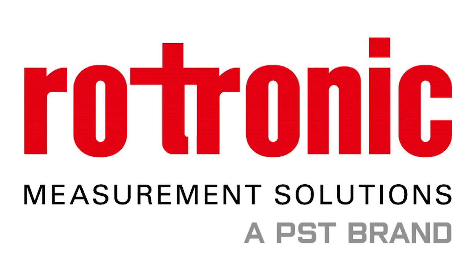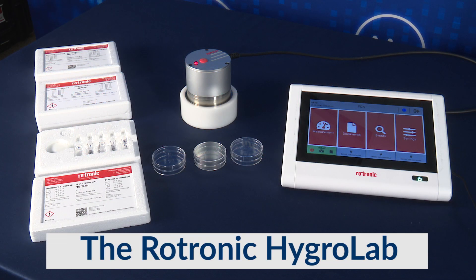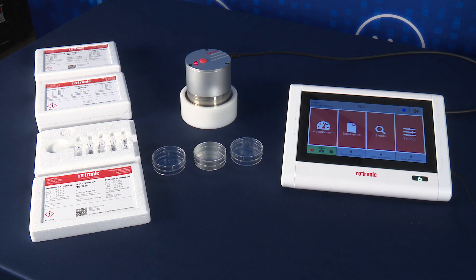Today we're going to demonstrate how to adjust or calibrate your Rotronic Water Activity Probe via the Benchtop Unit Hygrolab. It's important to note you want the room or the environment you're in to be of good temperature stability.